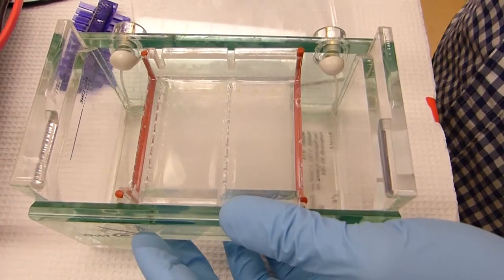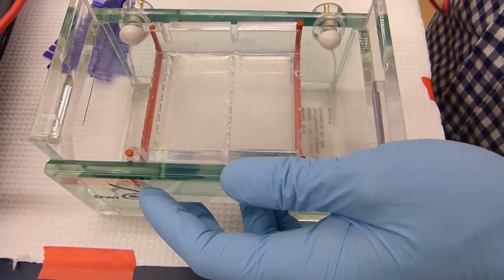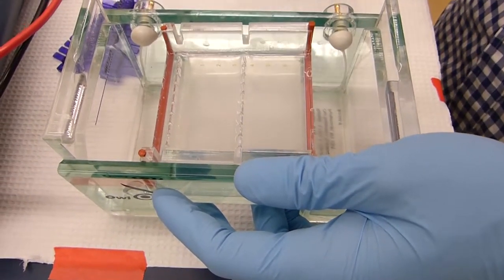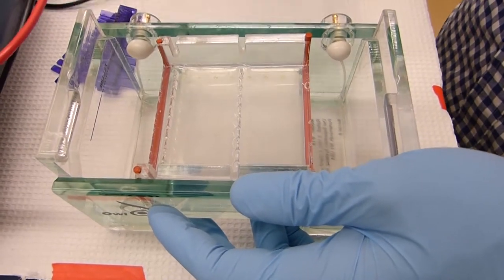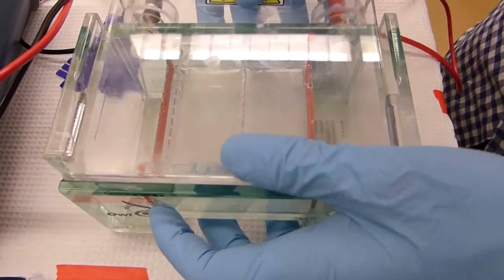You want the side with the holes by the black node, because DNA is negative so it will run to the positive node. So you want to run to red.